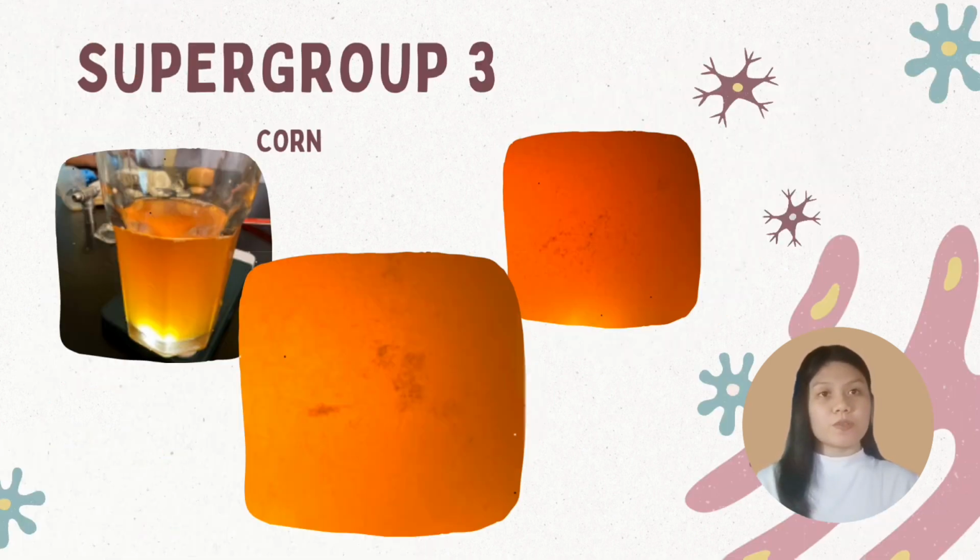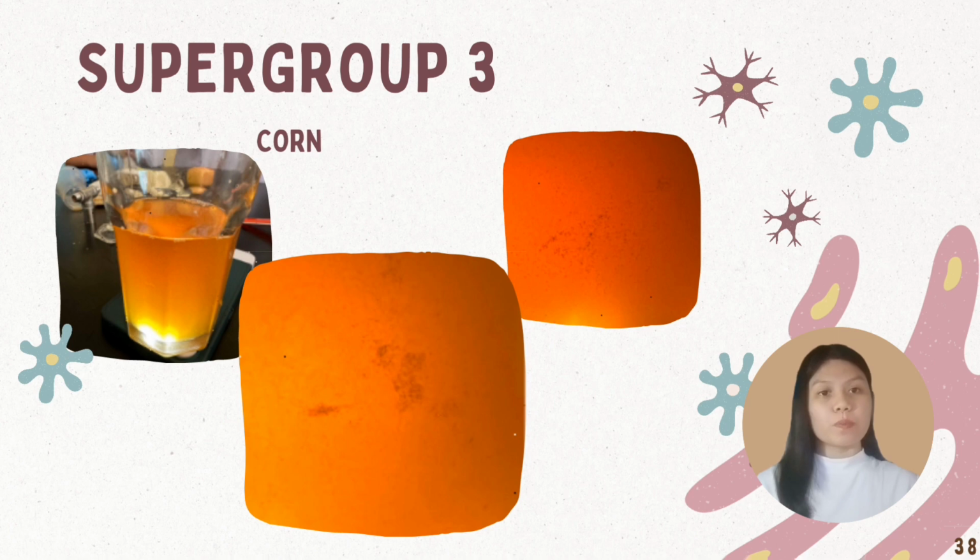Our third sample is corn, which was used by supergroup number 3. Here we can see that something is floating at the top of the sample. Was group number 3 able to extract the DNA? No. Although there is something floating in the group's sample, that is not DNA. It is most likely pollutants that occurred during the procedure or came from the products and materials used by the group, including dirt carried by the wind. And with that, the answer is supergroup 3 was not successful in extracting the corn's DNA.